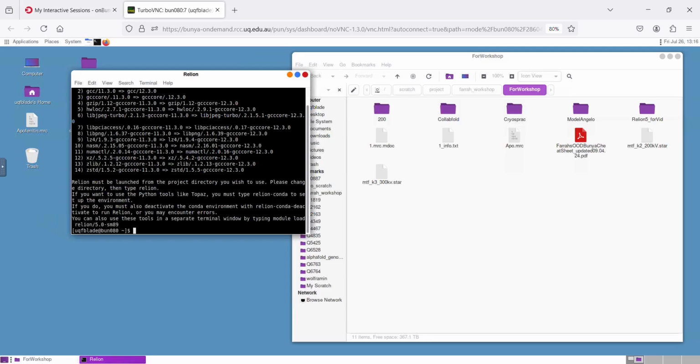It doesn't like to come in and out of its folder, so just make it a fresh folder. That's what we have here. And make it a fresh folder, and that is where it's going to live. So when we start up RELION for that specific data set, it will always be that data set that it finds. So each time you have a new data set, make a new folder, and that will be where that RELION lives.